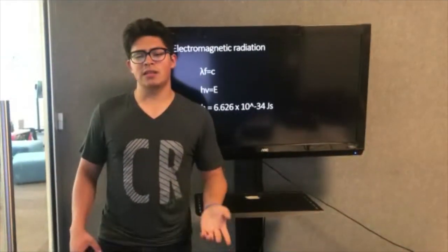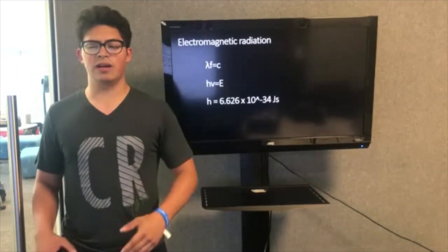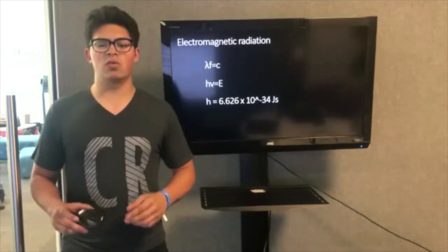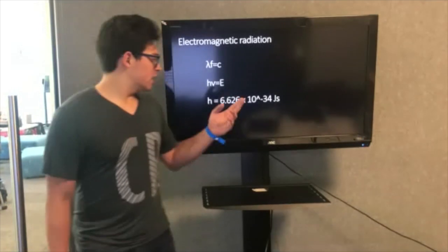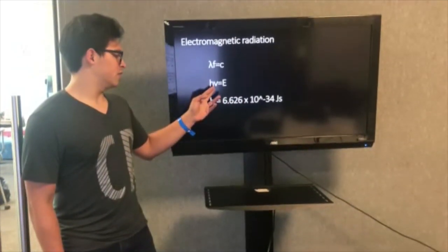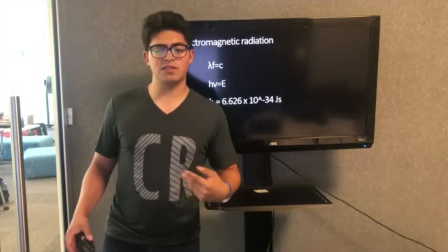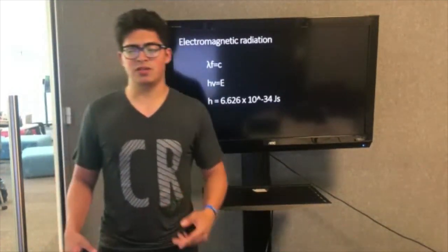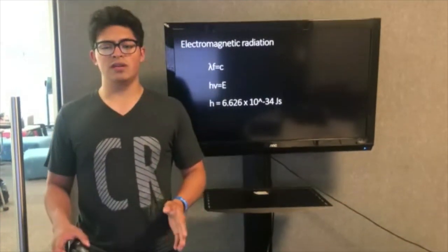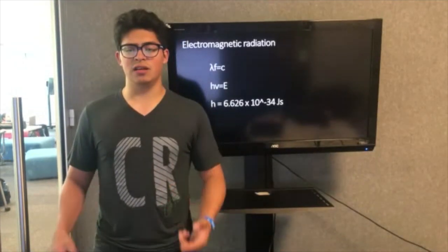Also, by the work of Einstein, Planck and Bohr, it was indicated that in many ways electromagnetic radiation could be regarded as a stream of particles or quanta for which the energy E is given by the Bohr equation, which is the Planck constant times the classical frequency, and this equals the energy. This means that the processes of change, including those of vibration and rotation associated with infrared spectroscopy, can be represented in terms of quantized energy levels.